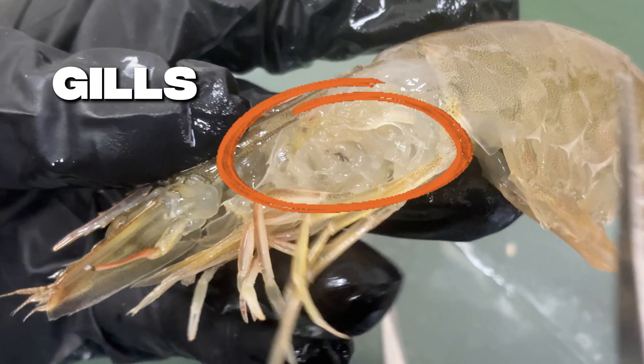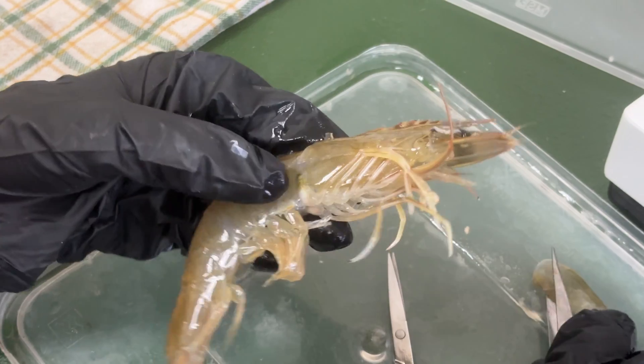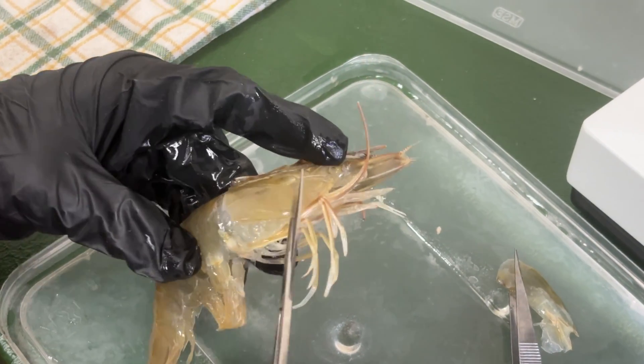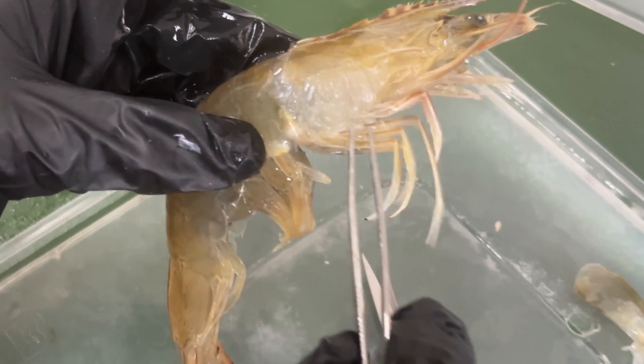These are the gills. They function like lungs, allowing the shrimp to breathe underwater. Gills help absorb oxygen, remove carbon dioxide, and even regulate salt balance and waste. We have both sides of the gills — this is the right side of the gills.